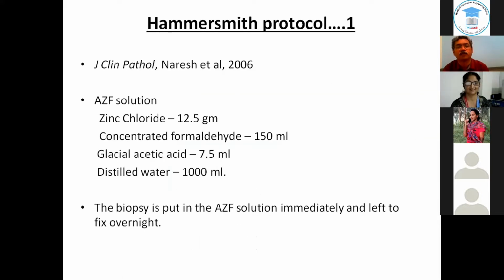I'll be talking about the trephine. And until 2006, most of us used to botch up our bone marrow trephine biopsies because we used to treat it like any other biopsy: put it into formalin, then put it into acid, and then put it into the processing machine. And that was it. And really, we didn't get good stains.